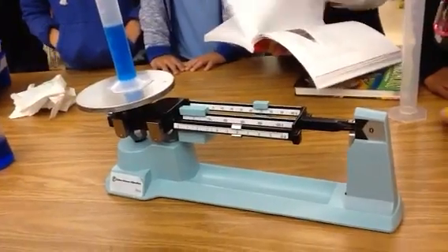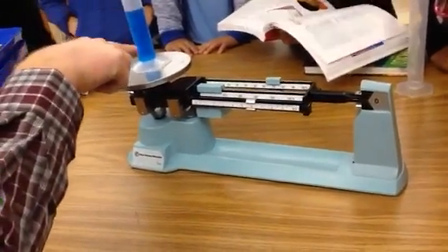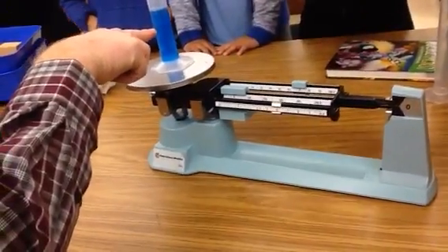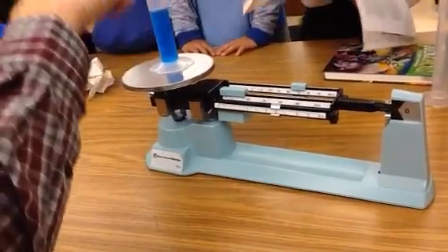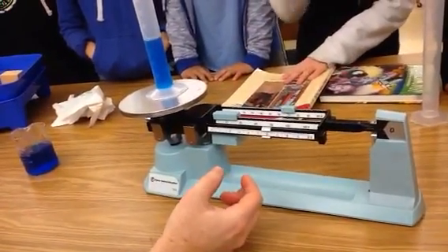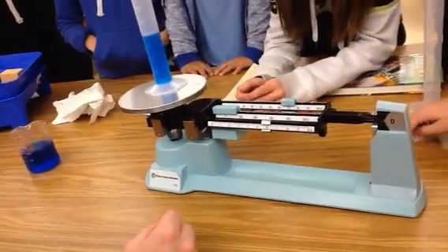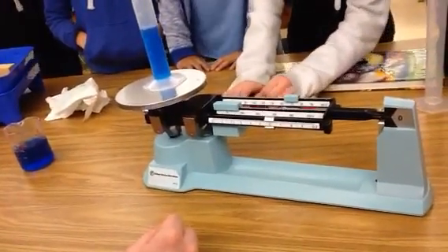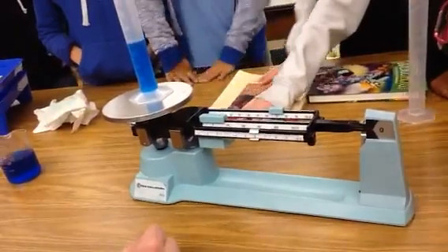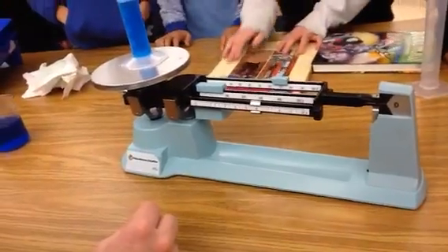So what you're going to do — and we'll look at the board in a second — is you're going to take the total. 76 is the water and the container together, that's 40 milliliters plus the container, and then you subtract 37.7. So that's how we find it. You're going to make that subtraction problem and we'll put it up on the chart on the board. That's how we do it. Signing off.